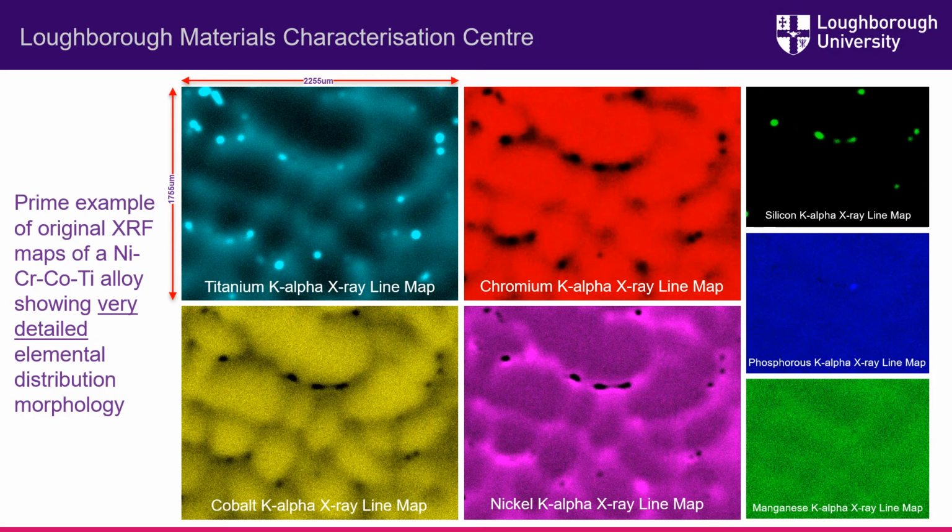In this slide, we can see the power of deep penetration analysis of a nickel, chromium, cobalt, titanium alloy. It gives us a more 3D visualization of the bulk volume and greatly helps us in characterizing the sample.